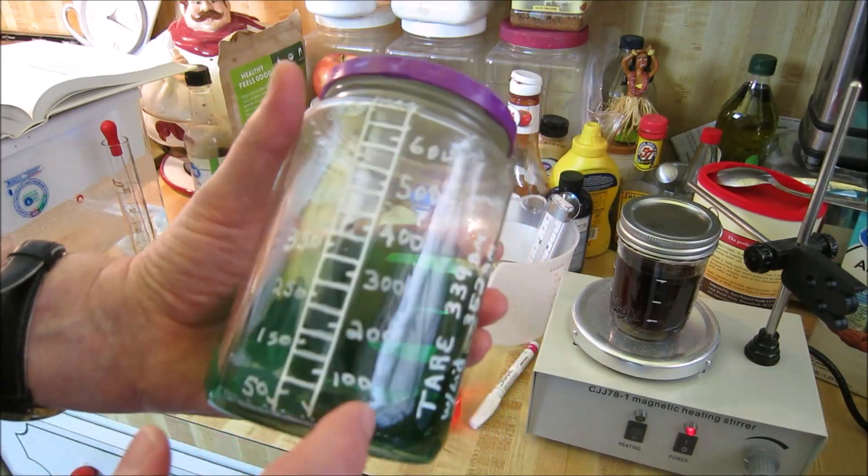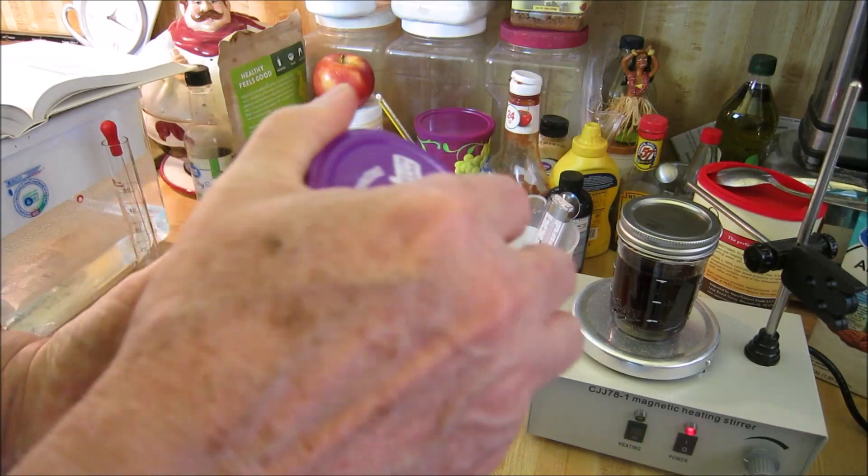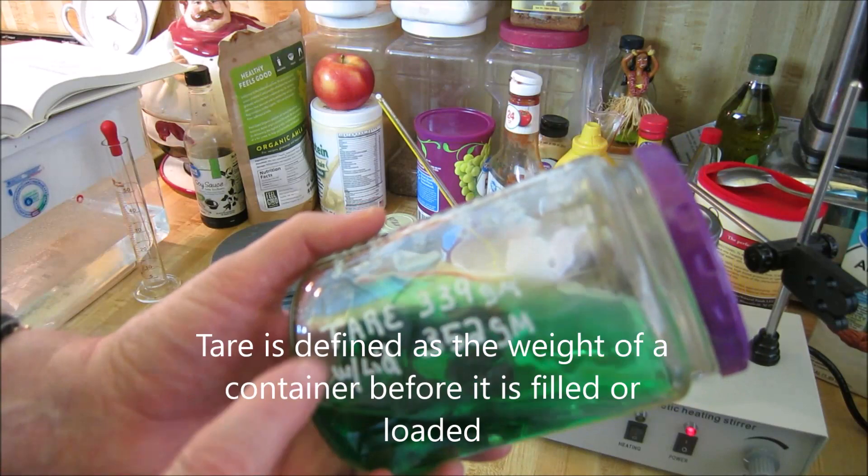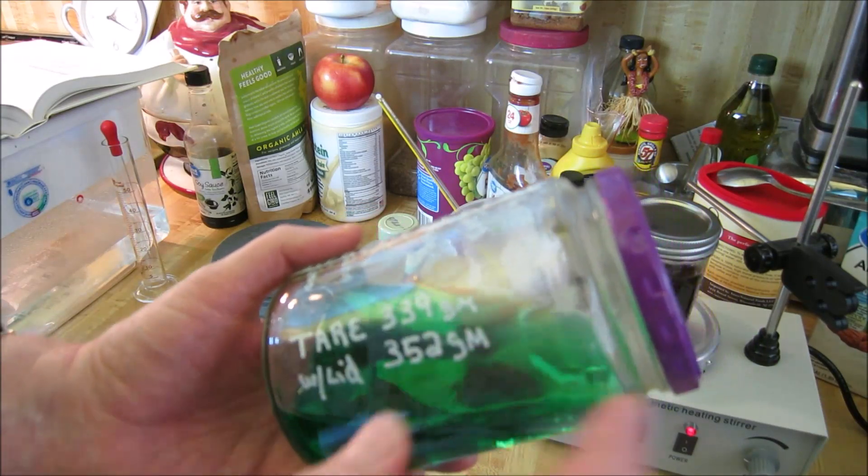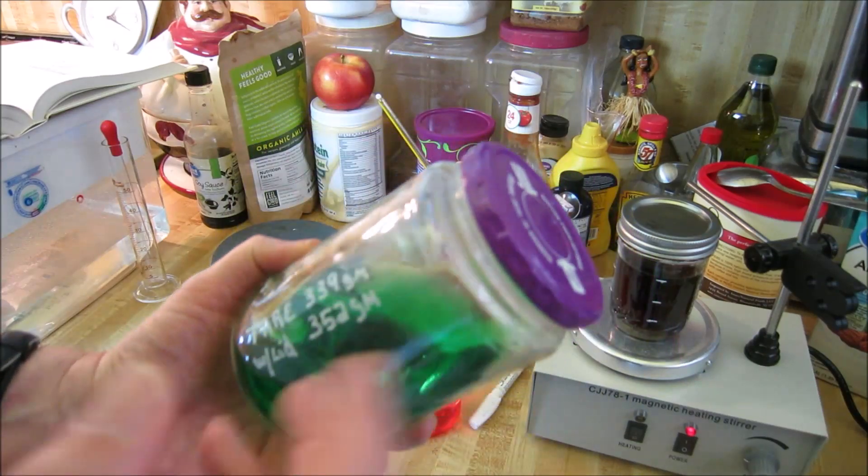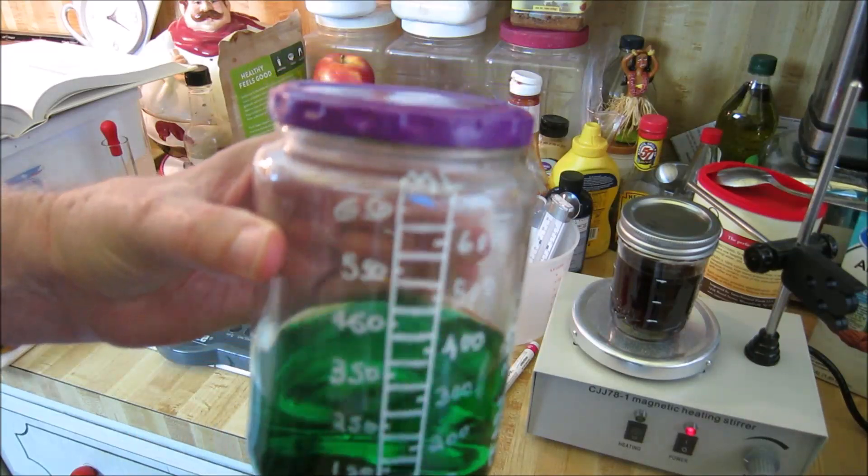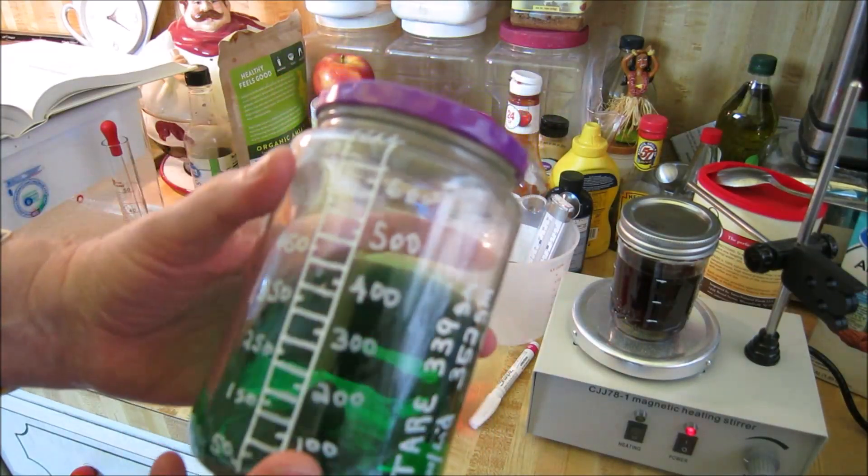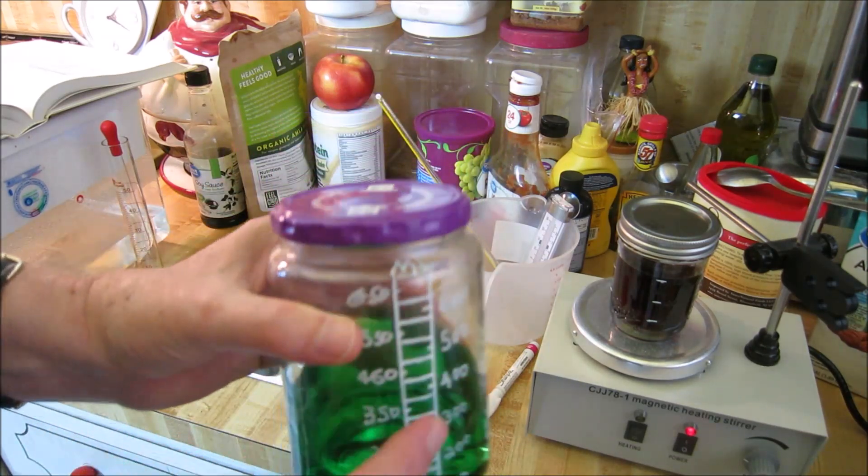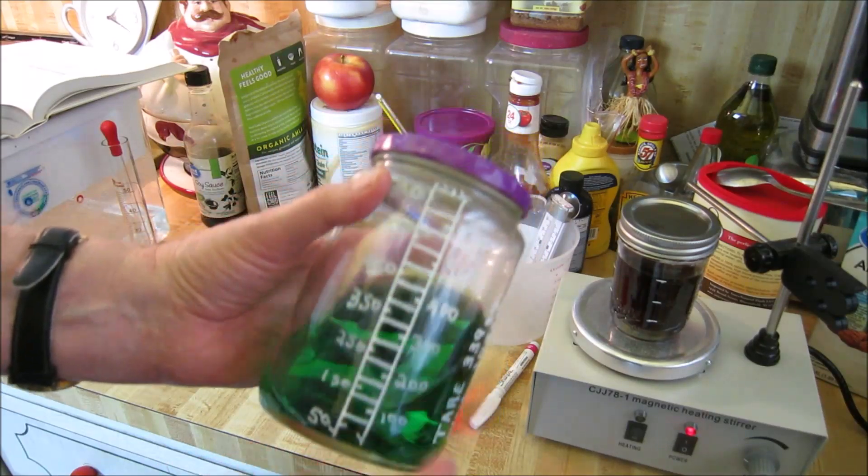So we just made 50 ml markings on this. And whenever you do make a container for measuring, you should always get the tare weight of it. This tare is 339 grams without lid and with the lid, the tare is 352 grams. So you can know what your volume is at any time by measuring it. And that's how we did it. We put this on the scale and added 50 grams at a time.